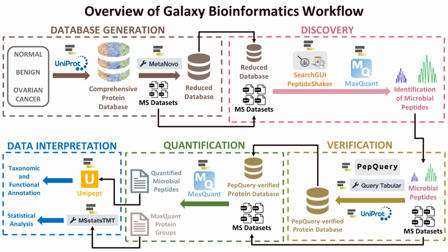In the discovery module, we will use 2 peptide identification programs, SearchGUI Peptide Shaker and MaxQuant, to identify peptide and protein sequences via sequence database searching. This will allow us to retrieve reliable microbial peptides.